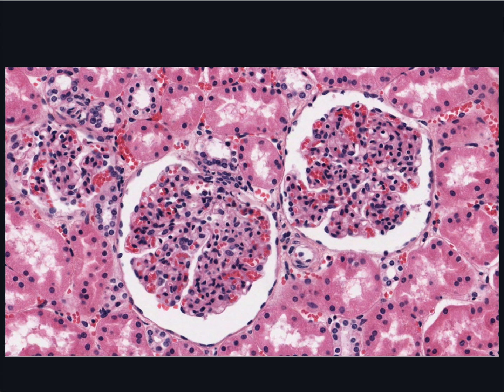Renal corpuscles show up very well here. You're able to see the outer or parietal layer of Bowman's capsule, which is simple squamous epithelium lining the urinary space. The visceral layer consists of podocytes that wrap around the capillaries of the glomerulus. So this is the glomerulus that appeared as one of those tiny red dots I referred to in those earlier images.